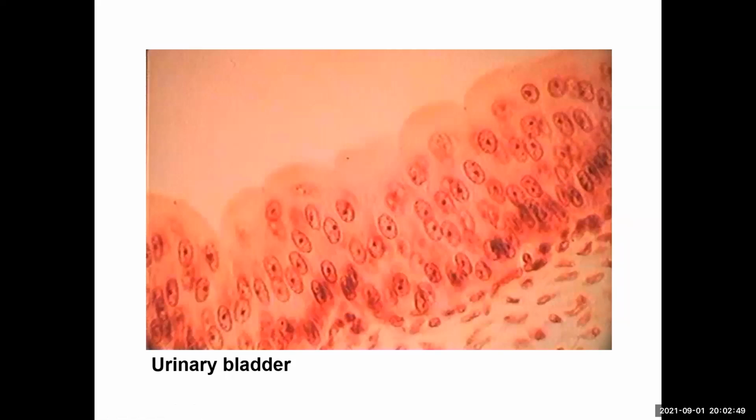We're going to see it in the urinary tract. This comes from the urinary bladder here. Now, if the bladder was full, all of this epithelium would be flat. It'd be smooshed down, like it would look kind of like what you see down here.